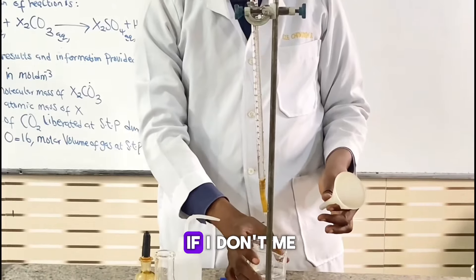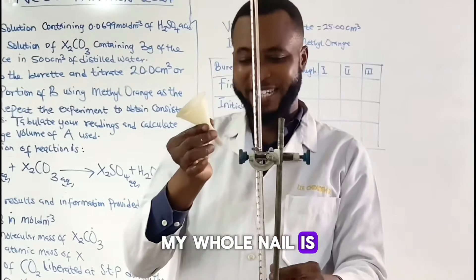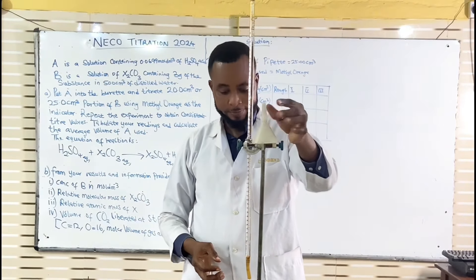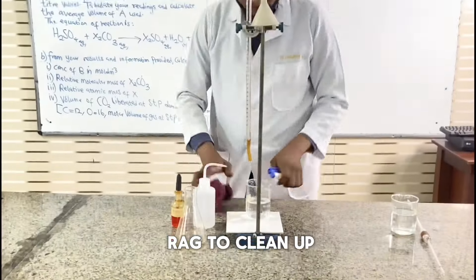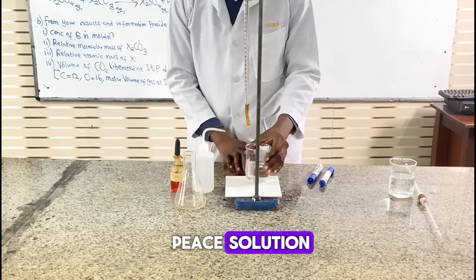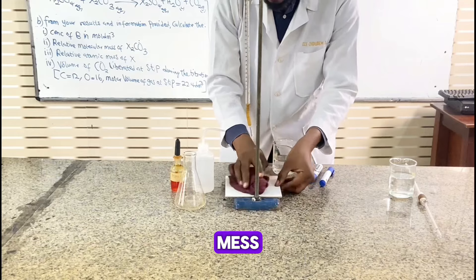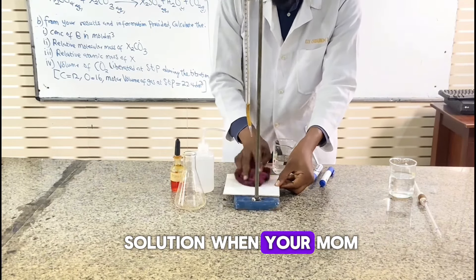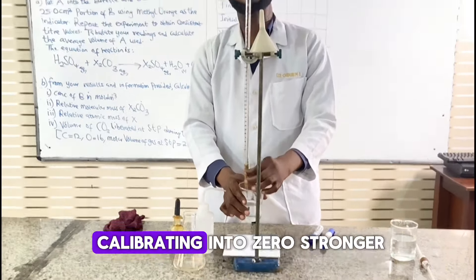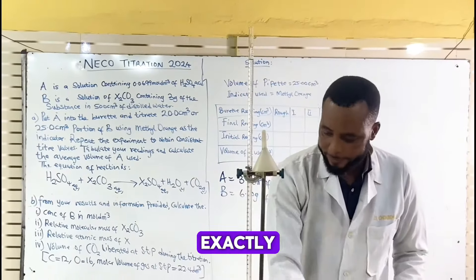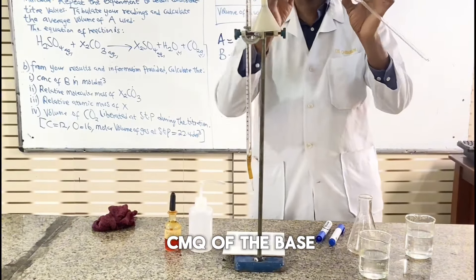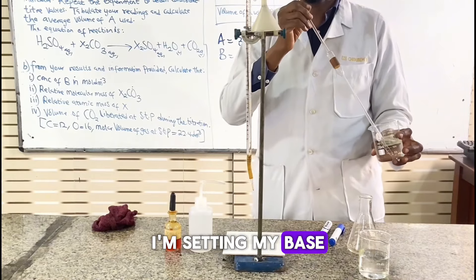I have a burette here. My funnel is bigger than the opening of my burette. Nevertheless, I have a rag with it. It will clean up any spill — that's why it's necessary to take away the excess solution, so that you don't have this kind of mess. Don't mess up the solution. I'm calibrating it to zero. Now I'm using 25 cm³ of the base, putting the base into the conical flask.